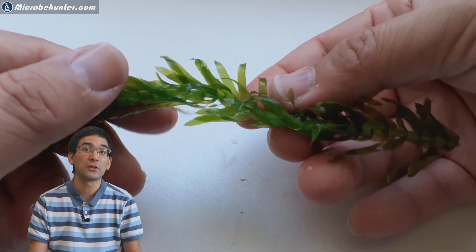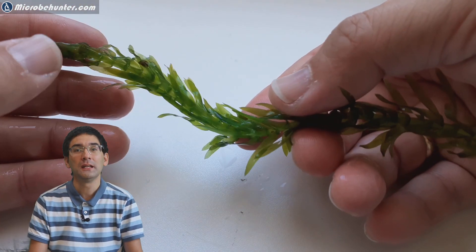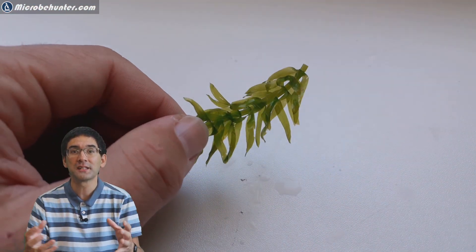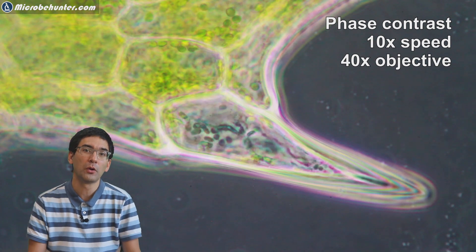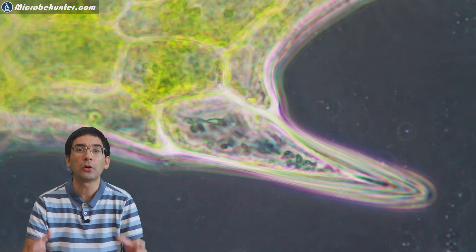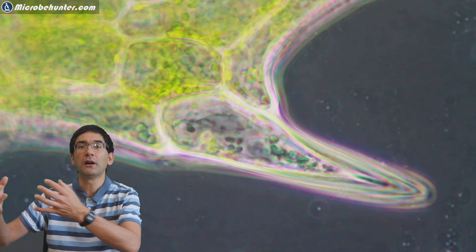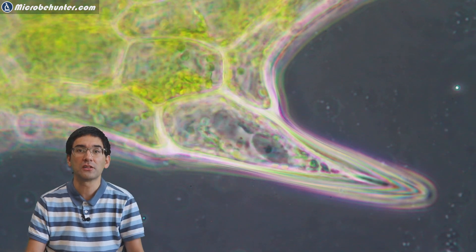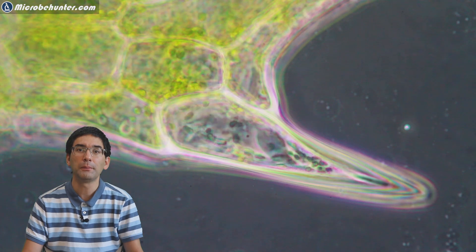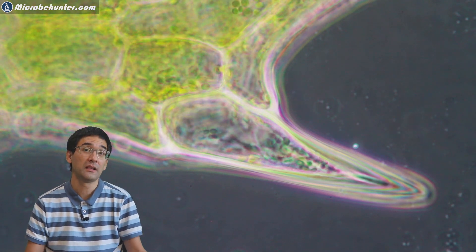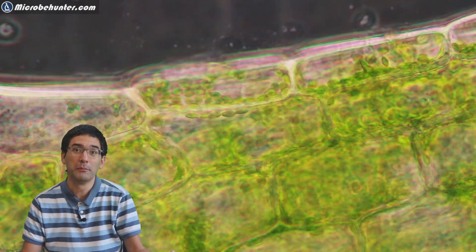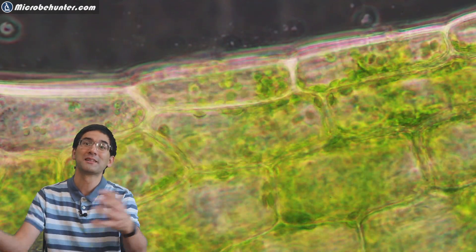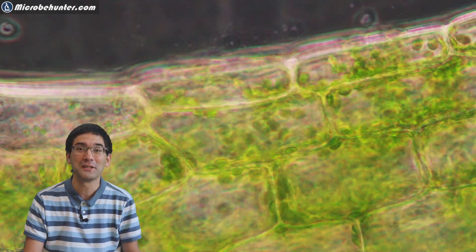And this is called cytoplasmic streaming. And this basically means that the cell organelles inside this cytoplasm, the cytoplasm is the liquid content of a cell, and this cytoplasm moves around because the chloroplasts can also be moved to those parts of the cell where there is the most sunlight. So this is actually something that can be observed in some plants. It could also be that the cell simply moves other substances around and the chloroplast is simply dragged along with it because it doesn't really make a difference anyway.